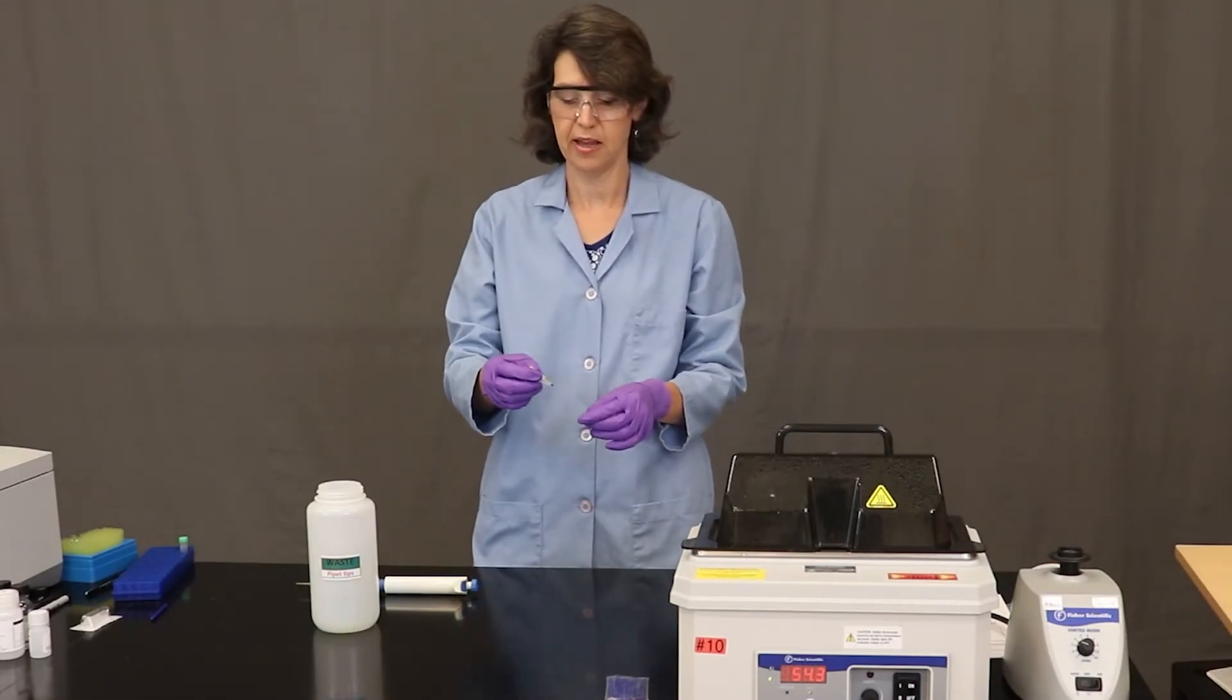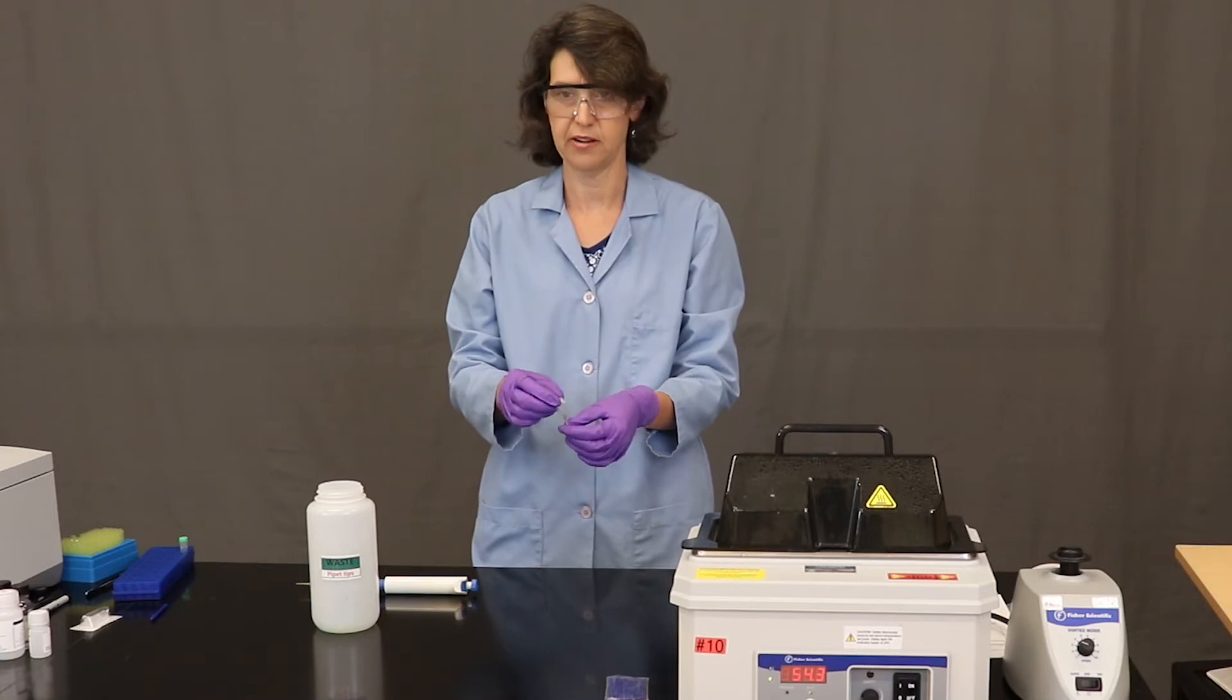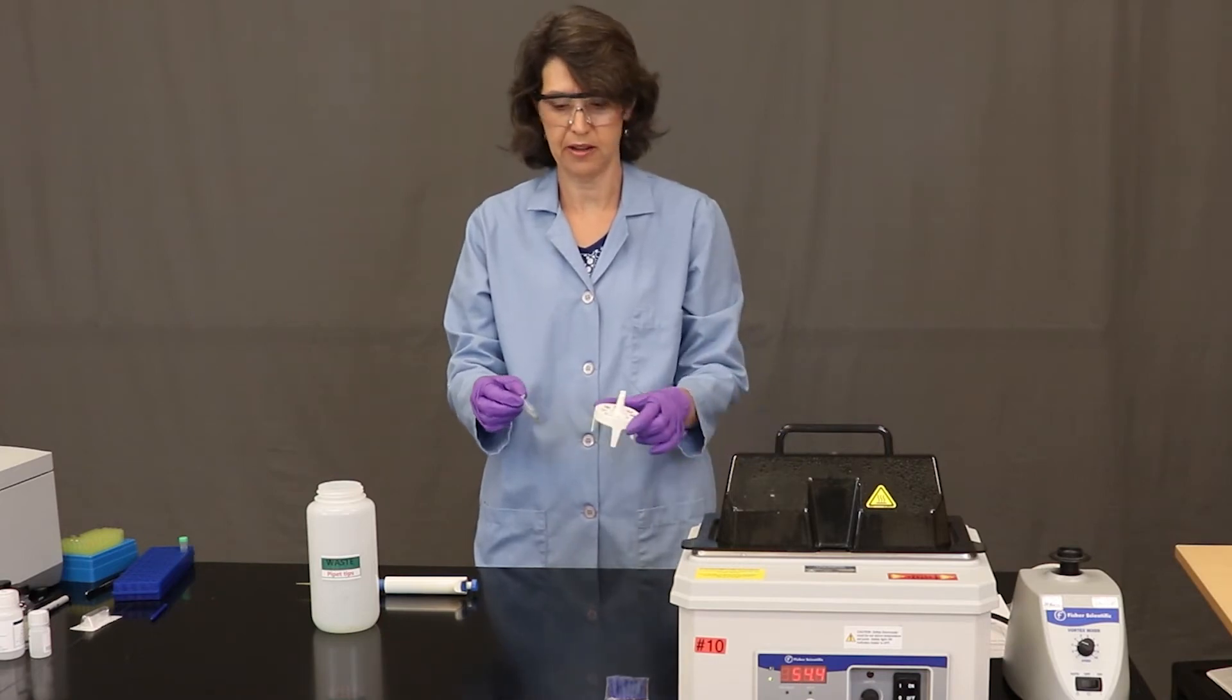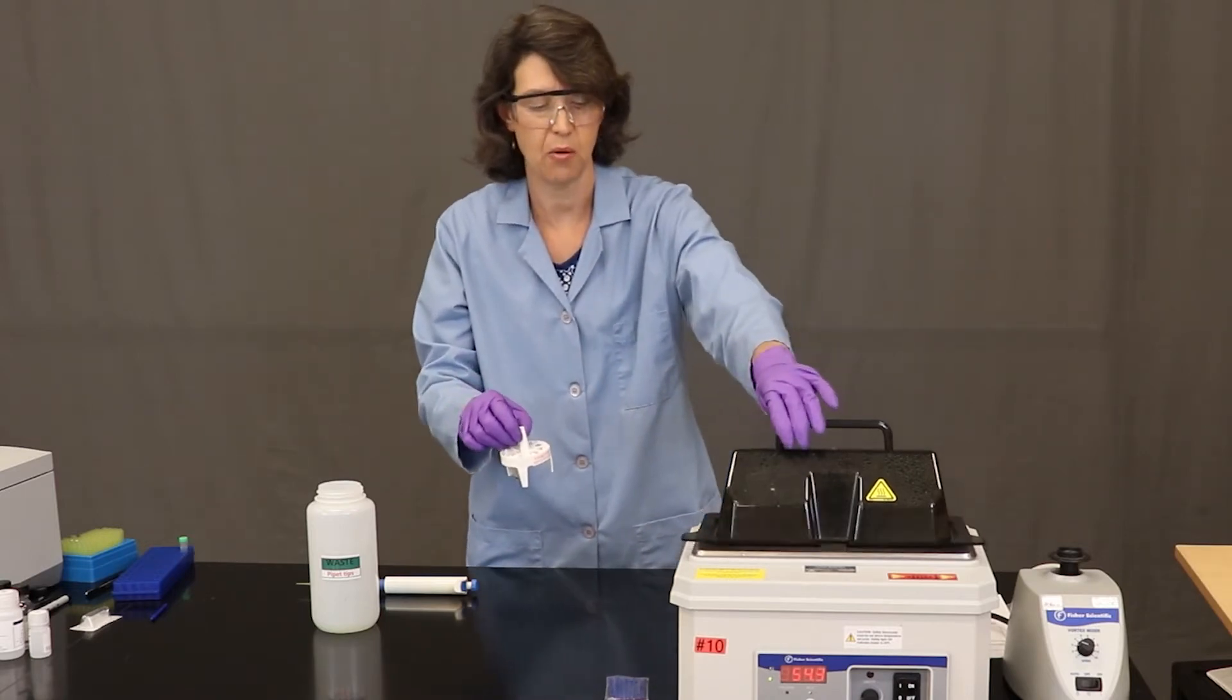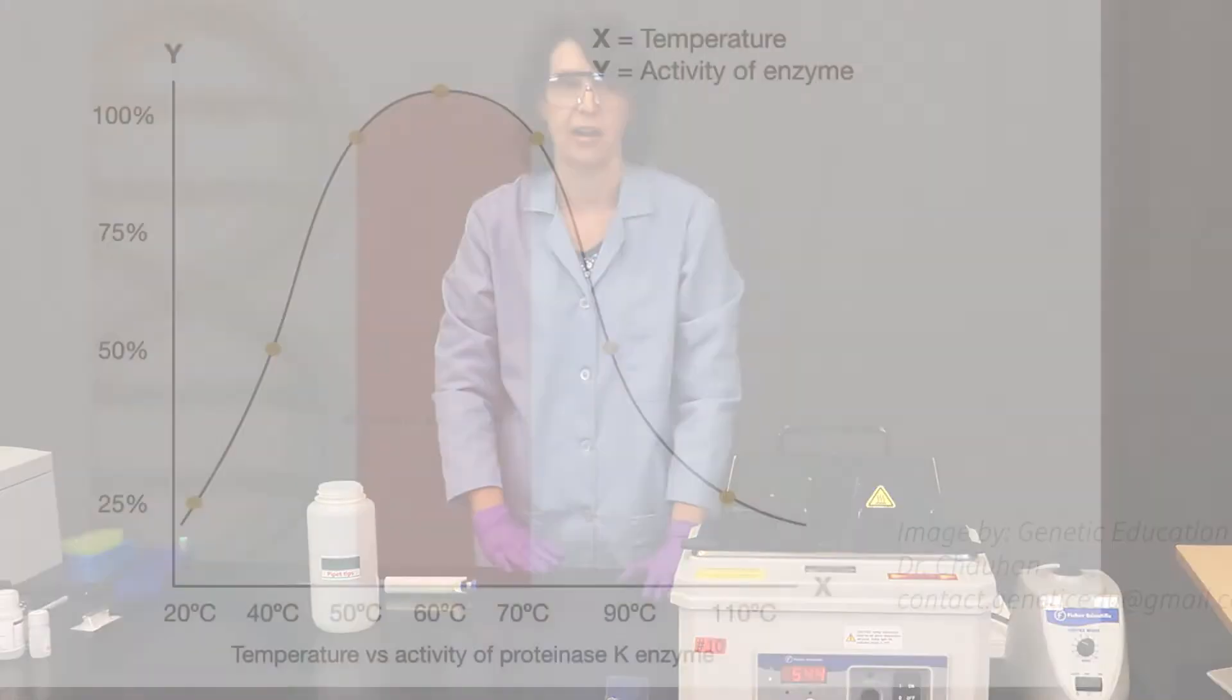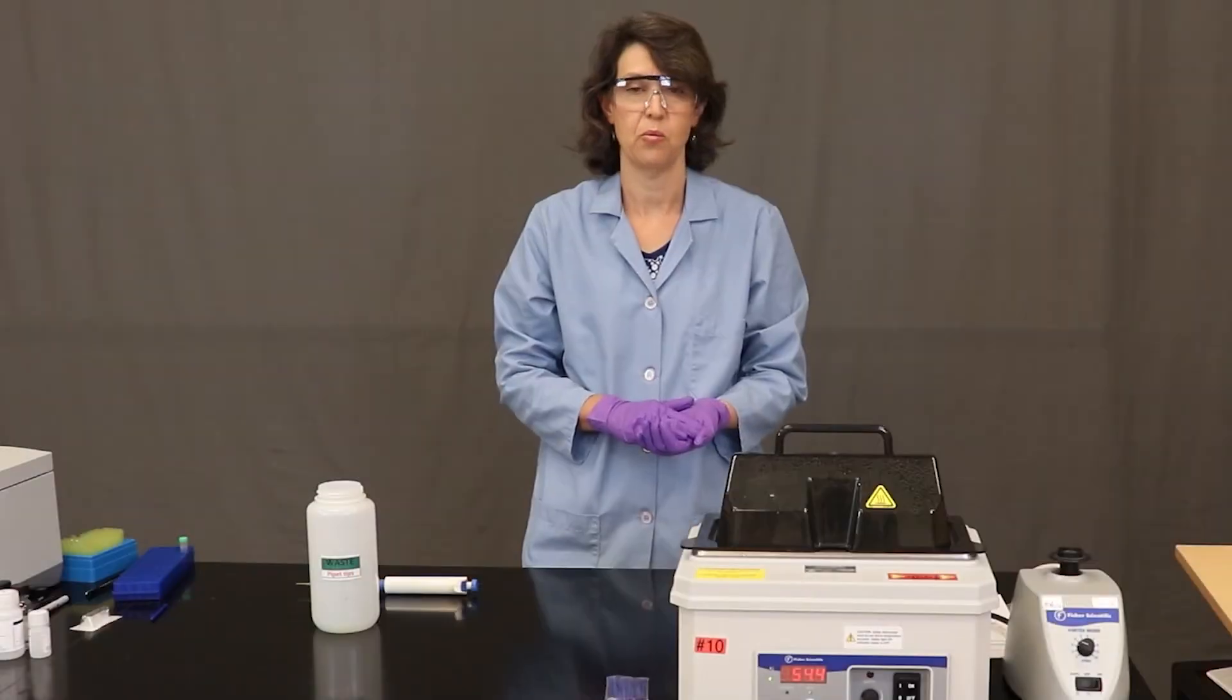So I've got my proteinase K enzyme plus the lysis solution. And I've inverted it several times to mix it. I do see some bubbles in there. So they look soapy. And now I'm going to put the tube in a little float container and place this in a hot water bath. So this particular water bath is set to 55 degrees Celsius. And that happens to be the temperature that is the optimum temperature for enzyme activity of the proteinase K. And we're going to leave that in the water bath overnight.